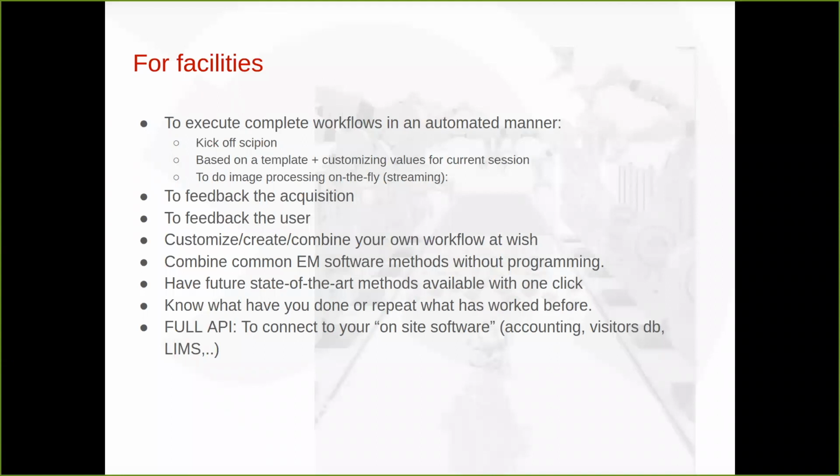Obviously you can combine many software packages, but not only that. Another thing is the fact that we can add at any time a new method that is released somewhere and is really working nicely. It can be integrated into Scipion. So it's not only what we already have, but what we can have in the future, and you will not need to change the software or redo your architecture.